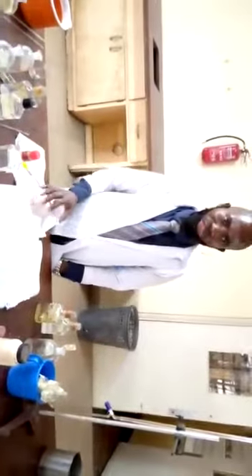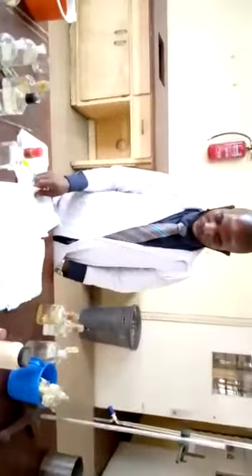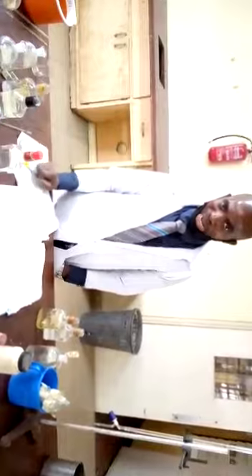We're going to look at some qualitative tests that we can use to identify amino acids and proteins in samples. I'm going to name some of them. Just listen, and then you will get them. We're also going to practicalize how we can identify some of these in samples. So just listen and look and make sure that you take your notes.